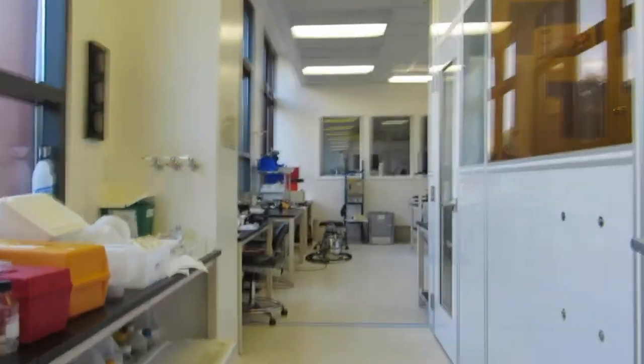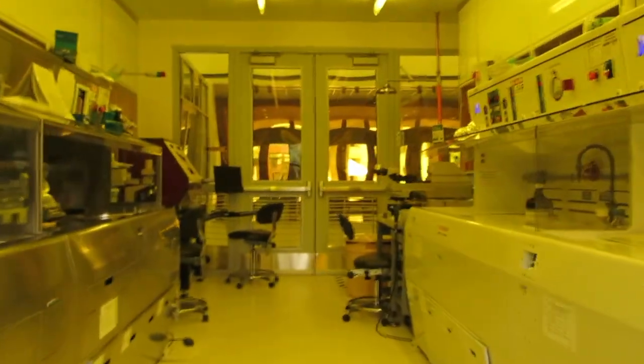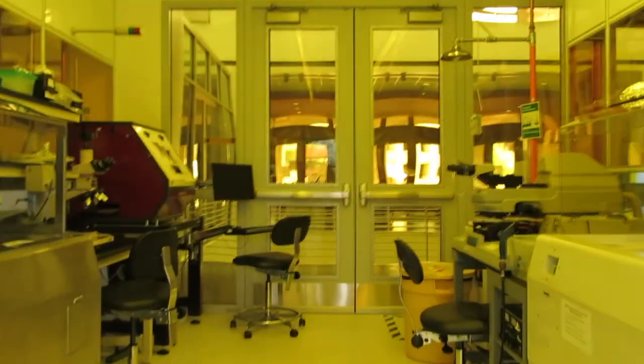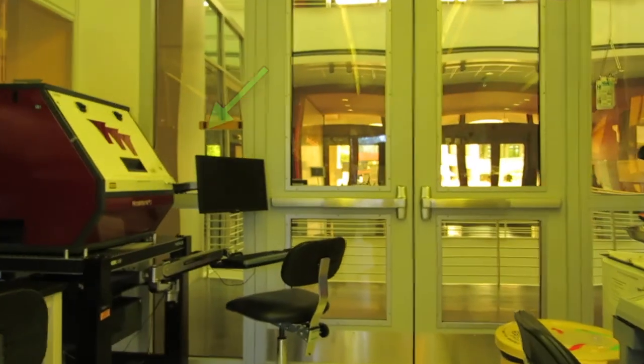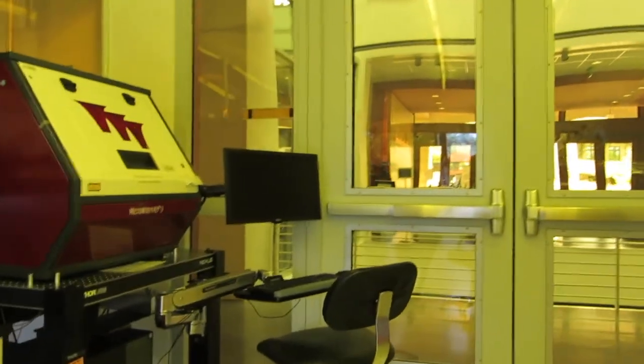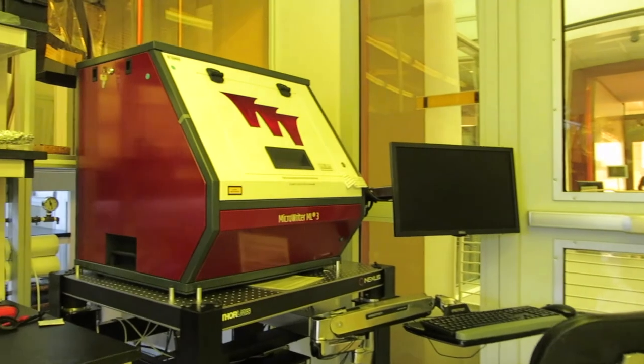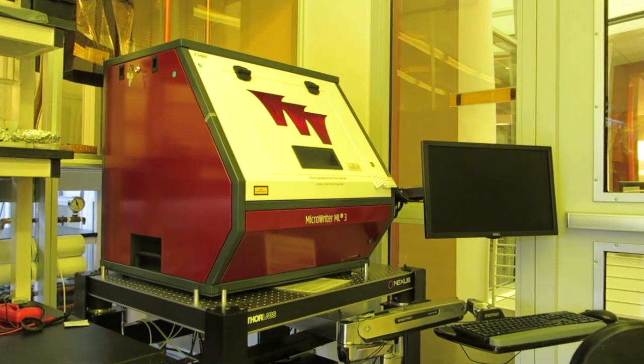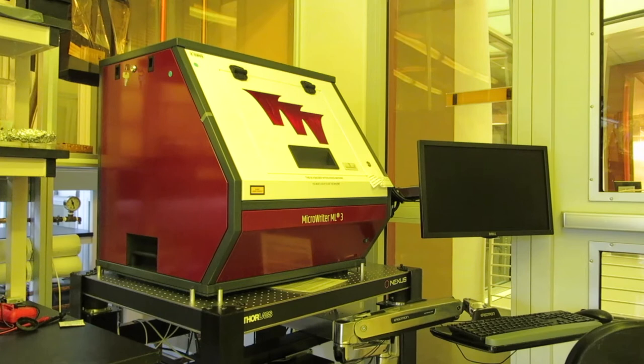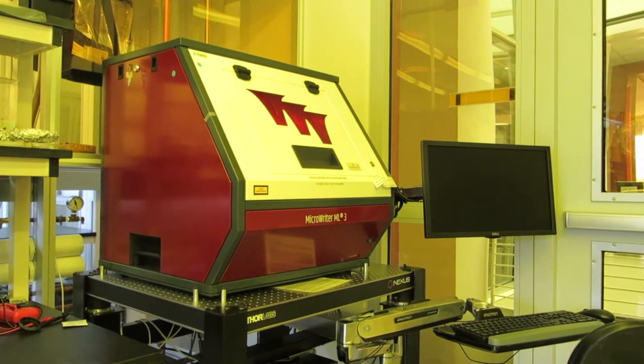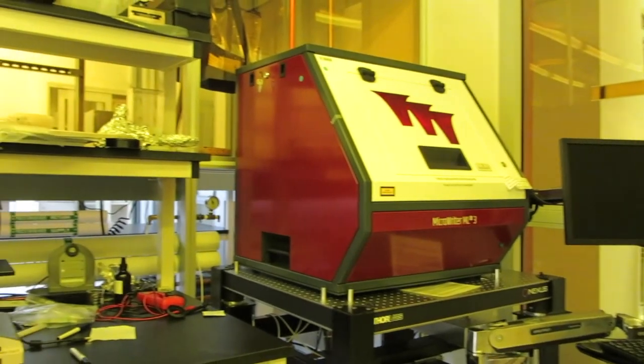Now let's head back to the yellow room. This is the ML3 direct write machine. This is a maskless way of exposing patterns into resist. You design the pattern using a mask design software such as Clewin and then it writes that pattern directly onto the resist.